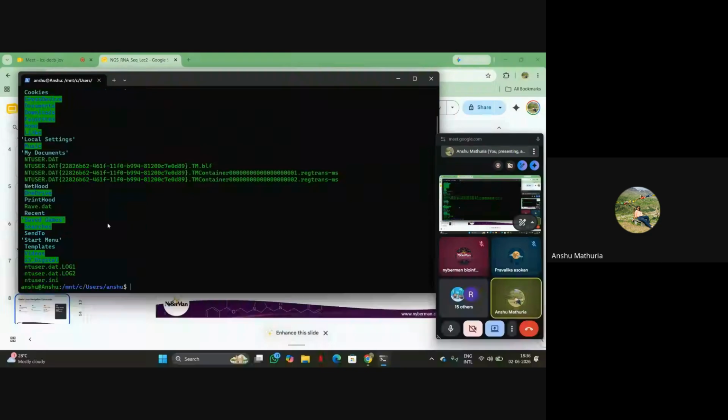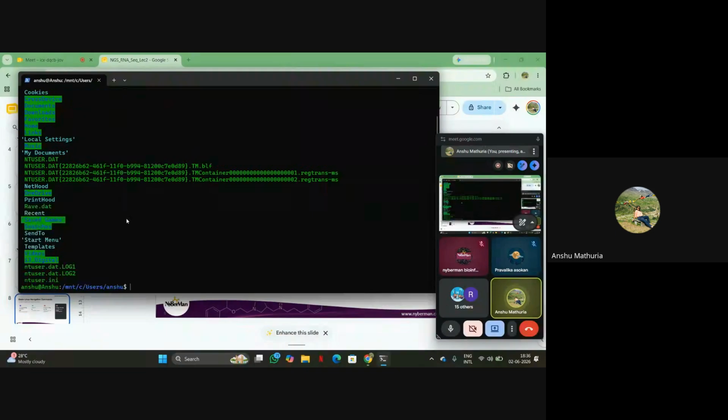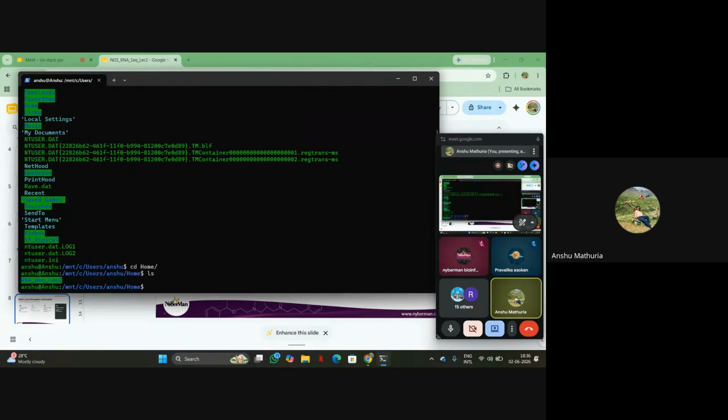You can see whatever is present, these are the text files. You might not understand, we'll create one and then we'll understand. I have created one. Ignore that command, now you understand.